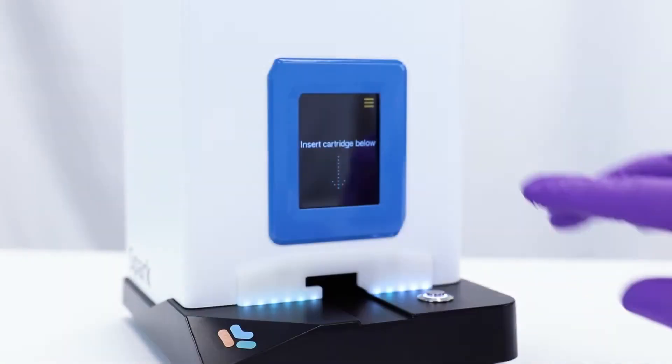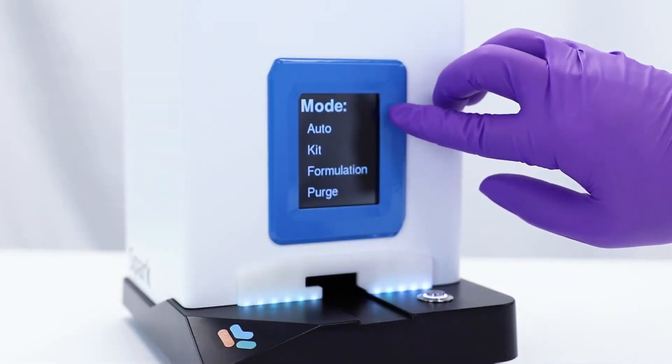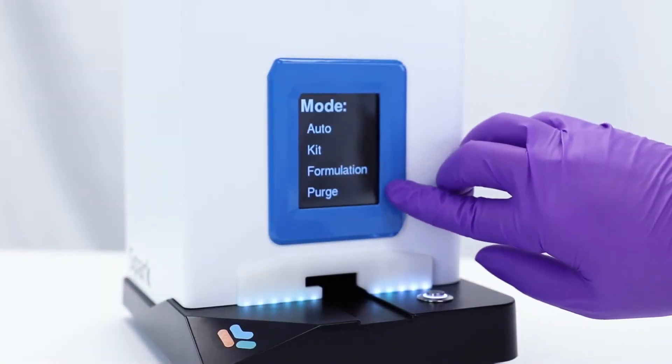The NanoAssembler Spark has four operating modes: three formulation modes and one to prepare the Spark for an aseptic setting.